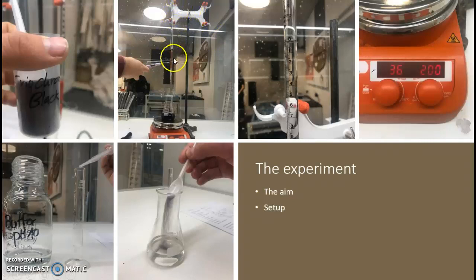We then filled up a burette with EDTA. We zeroed it, and then we put a bit of Eriochrome T black indicator into both the boiled water and the tap water to indicate if the calcium and magnesium ions were completely reacted.